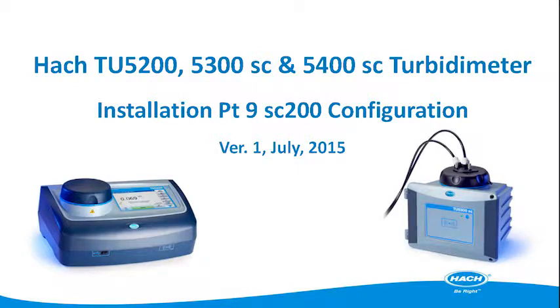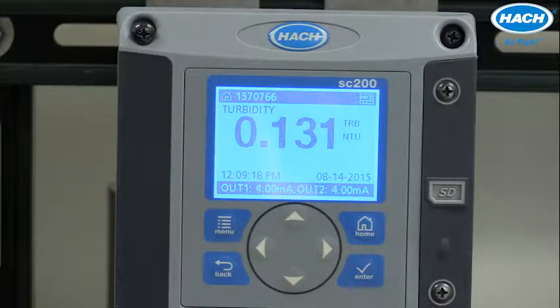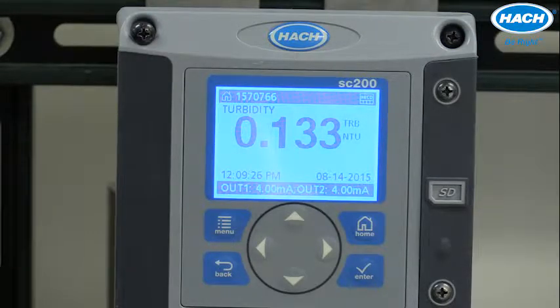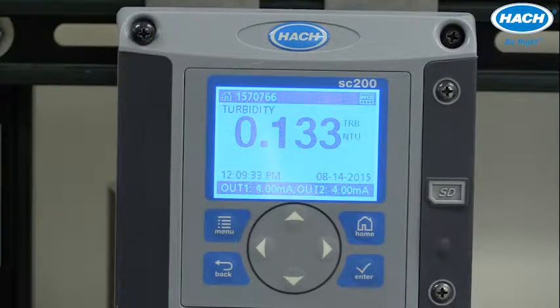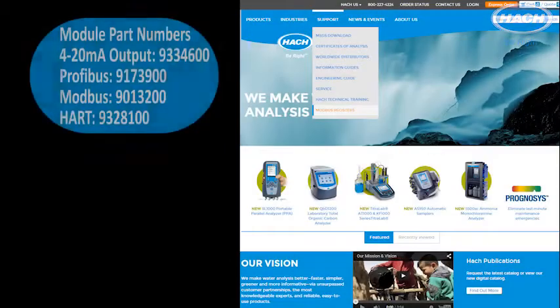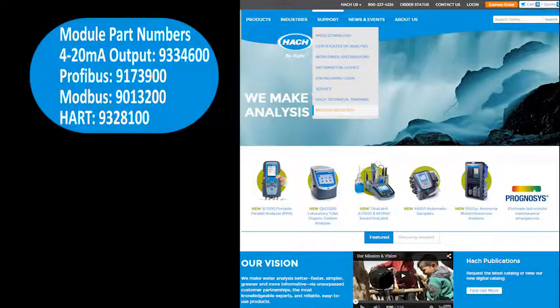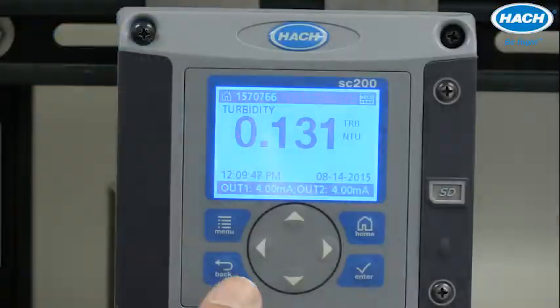The last item of installing the TU5300 or 5400SC process turbidimeter consists of configuring the digital or analog outputs for communication to a programmable logic controller or other type of digital control system. While this video will demonstrate the easy steps necessary to configure the analog outputs on the SC200, the digital settings such as Modbus or Profibus registers are available for easy download at www.hach.com.